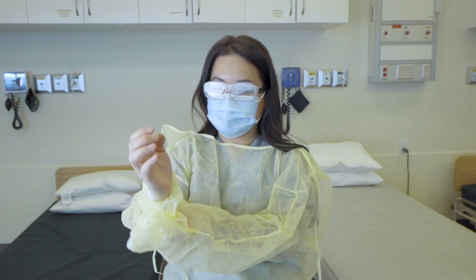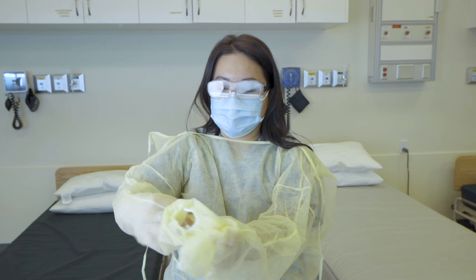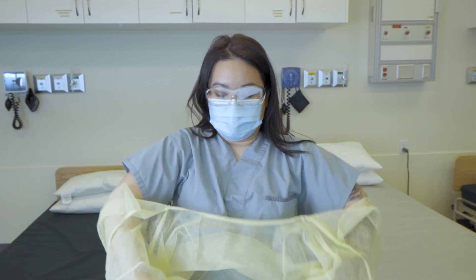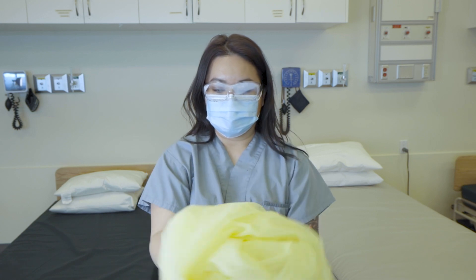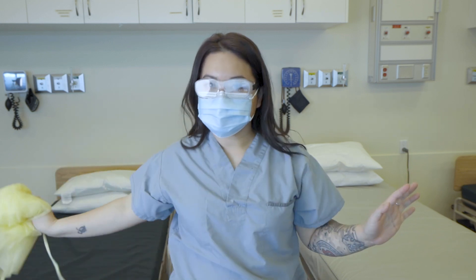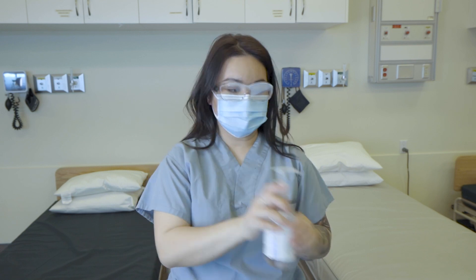Here I'm hiding my other hand inside of my sleeve just so it's protected while I'm pulling off the other sleeve of the gown. And then kind of roll it up into a ball, making sure that the outer portion is contained inside of that ball.